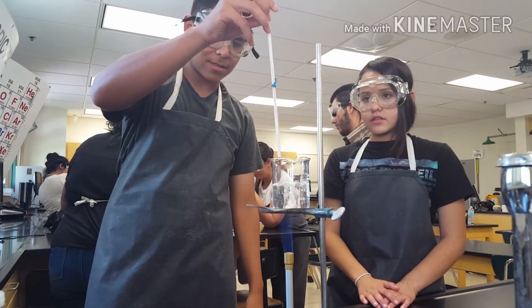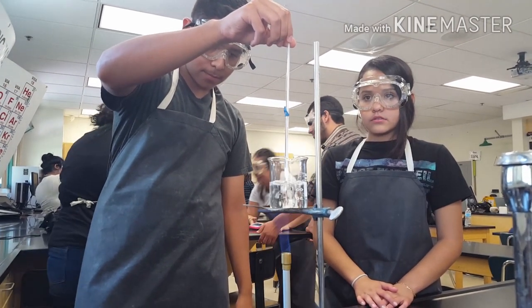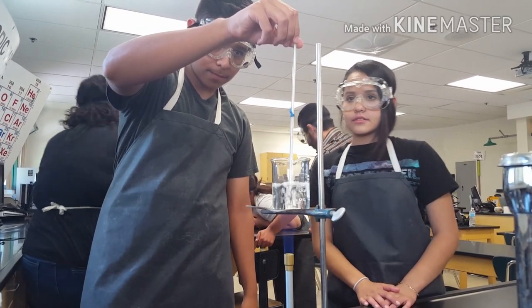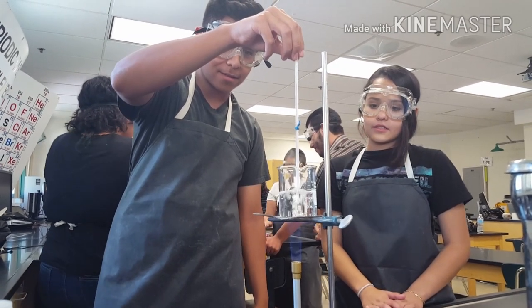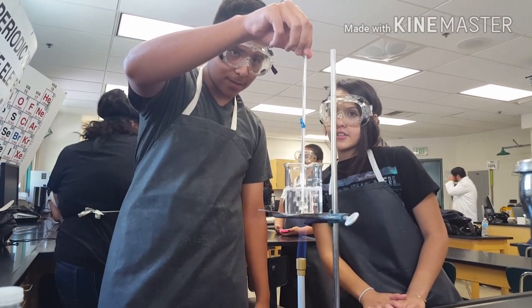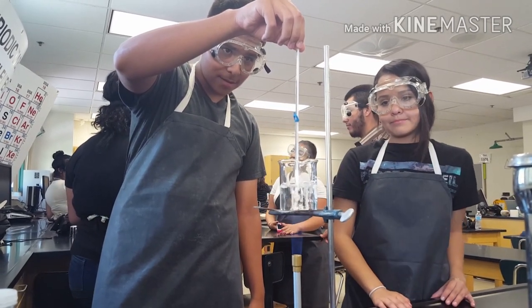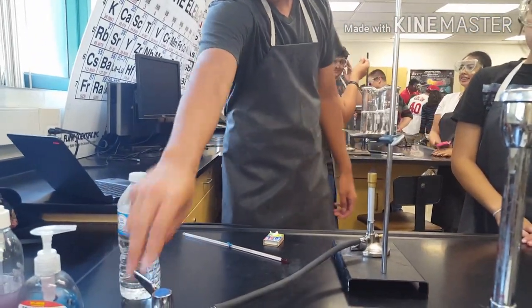Make sure not to touch the gas. You can see the temperature. Ready? 90 seconds. Temperature stayed at 96. You can turn off the gas.